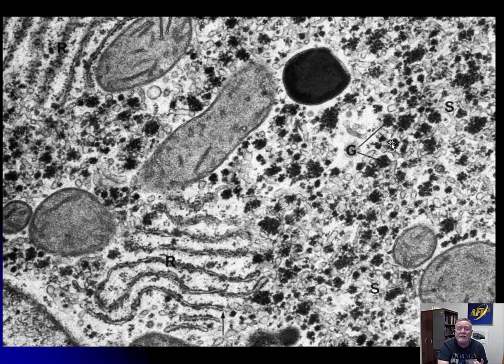But when you start thinking, okay, cells that contain glycogen, fat, and couch potato mitochondria, this has got to be liver. So this is the way we're going to progress through these lectures: we're going to take what we're given, we're going to think about it logically, and we're going to come to the magical diagnosis without seeing anything more than an eighth or a tenth of this cell. I'd like to say it works all the time. It really is helpful with liver. In some of the more complex organs, it's not as good.